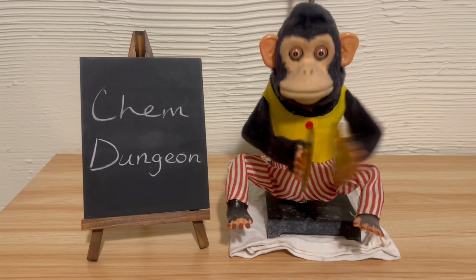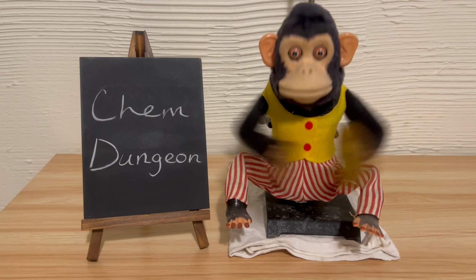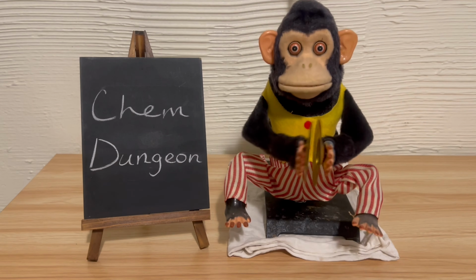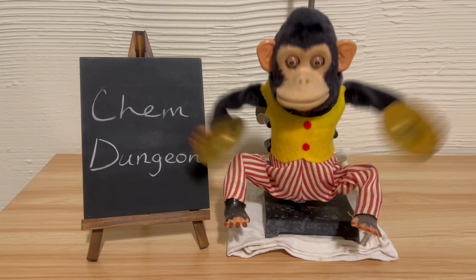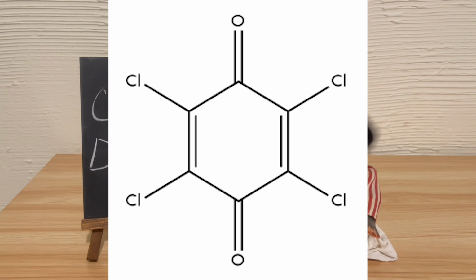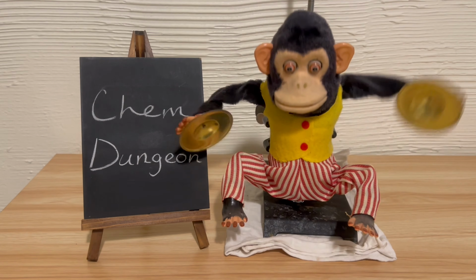in case it does. In my quinacridone synthesis series, one of the steps is oxidizing dihydroquinacridone to quinacridone. I used nitrobenzene in the previous video, but I don't have enough nitrobenzene to conveniently oxidize a large amount of dihydroquinacridone that I'll have. There are other methods to oxidize it, however, like chloranil. I could make some and use it, and I might, depending how what I have planned goes, but we'll see.